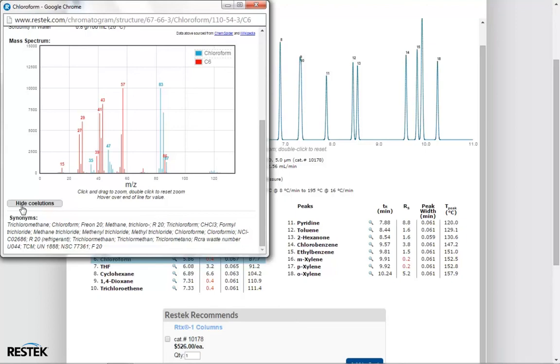So we can see in this case that we don't really have anything to worry about so far as this coelution goes, as long as we're MS users. That's about it for the model pane.